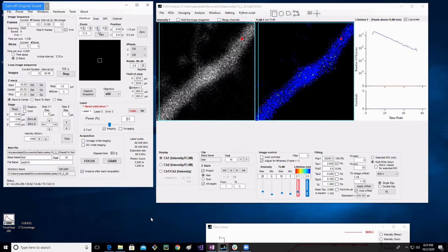Can you hear me? Yes. Okay, I have a quick question. How thick are the slices normally? So we cut them at 350 microns, but as they grow over 2 to 3 weeks, they tend to spread out a lot. So we don't know exactly, but probably around 200, something like that. Okay. And you shouldn't be going down more than 80 microns, you're saying? If you're uncaging on spines, I try to stay in the top 50 or so microns.